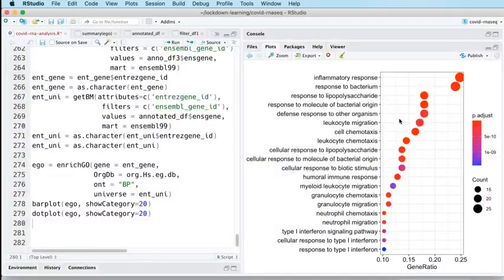These are ranked by some mechanism that I'm not immediately sure of. So the more you pull out, the further down that ranking it's going to go. Again, these are ggplot plots. So you can edit these by adding geoms and themes and things to them if you so desire, because they're generated using ggplot.